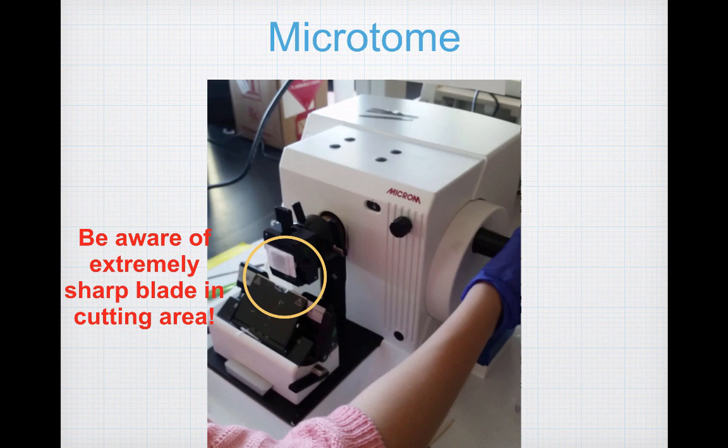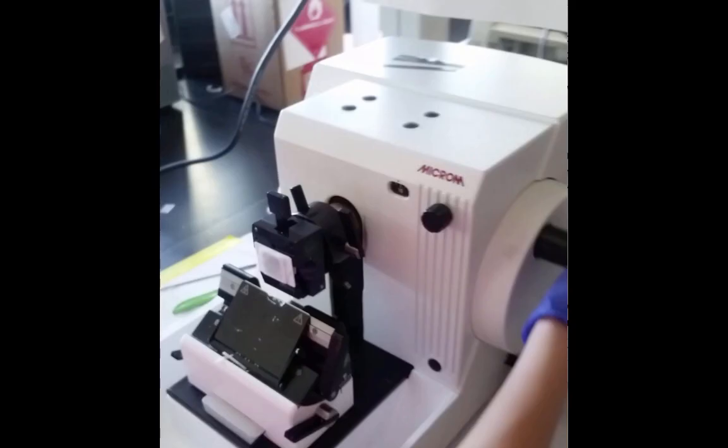It is very important to remember: do not become distracted when using the microtome. There is a major risk of injury from the extremely sharp blade located in the cutting area indicated by the yellow circle. Do not put your fingers near that area. Don't worry — you will be assisted when you use the microtome for the first time.